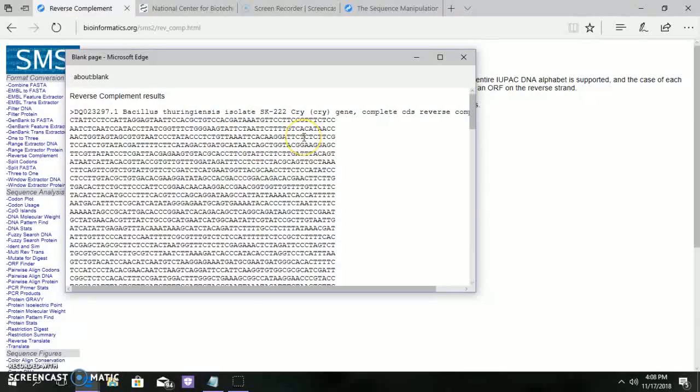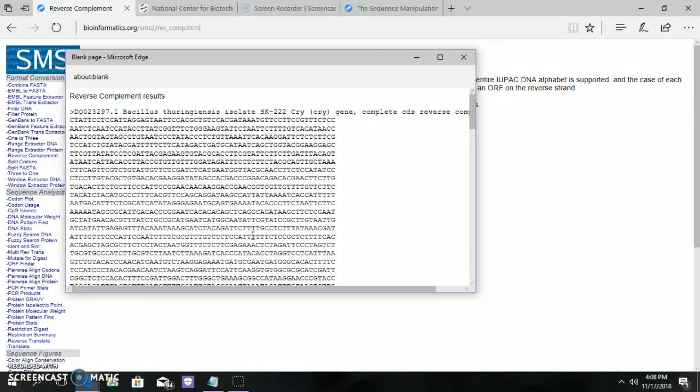For the CRI protein, the result is obtained as shown: the reverse complement for A is T, and for G it is C, and vice versa.